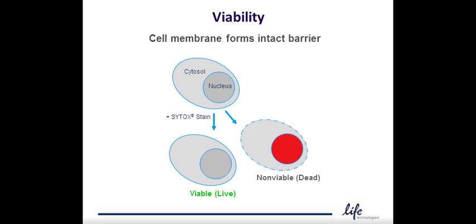Viability is often referred to as the integrity of the plasma membrane. Cells that successfully exclude an impermeant reagent, such as propidium iodide, are considered viable. Many of these same stains can be used for DNA content measurement in fixed cells.